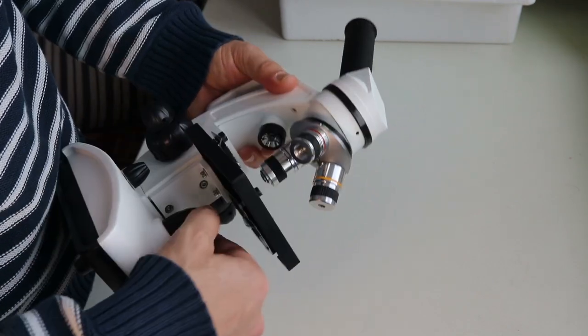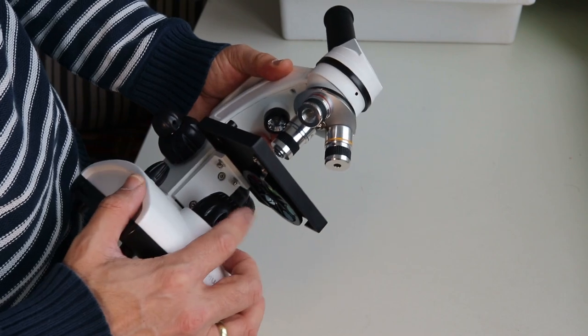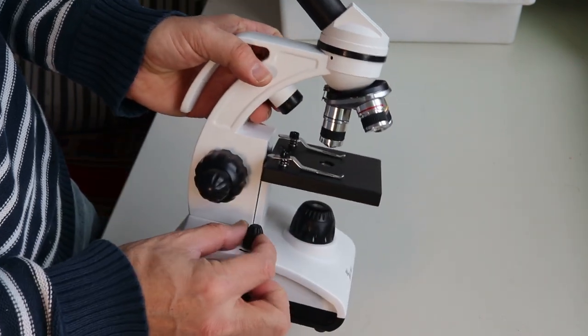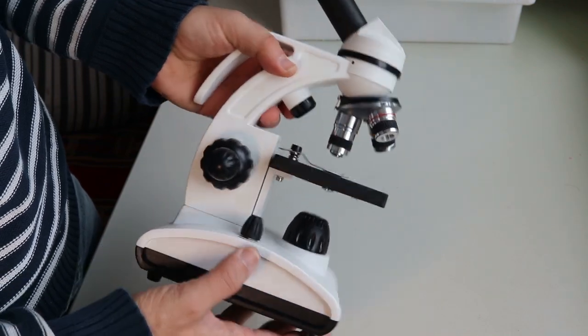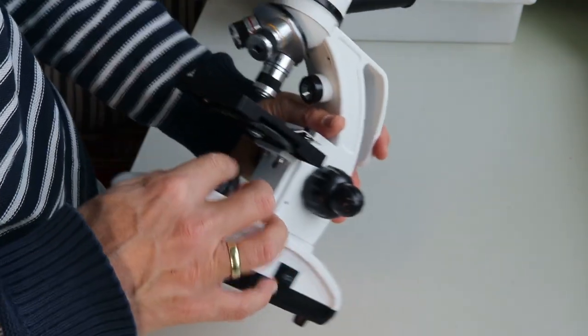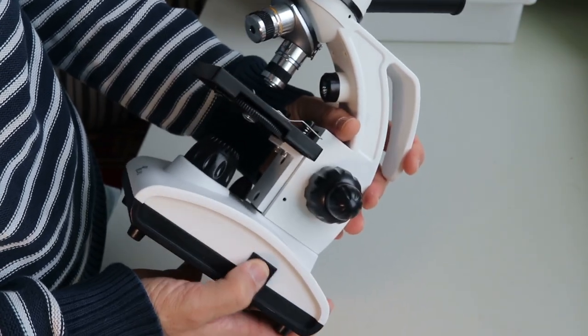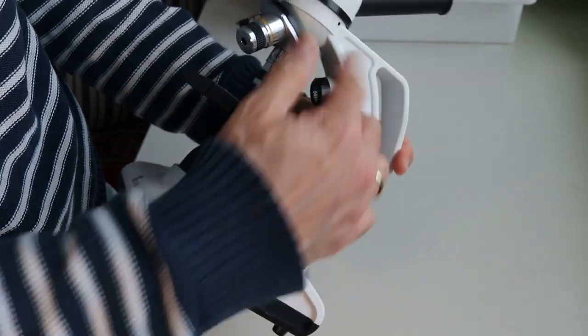Okay, over here is the LED illumination. I do not know how bright that is. The light intensity regulator is here. That's good. And you have two lamps. You have one down here, and the other one is from the top. And I guess with this switch, you can select.